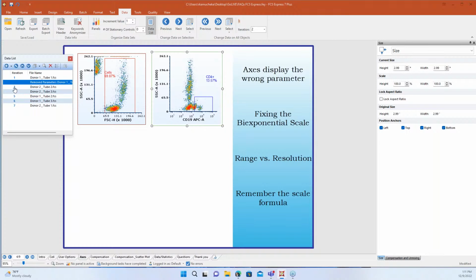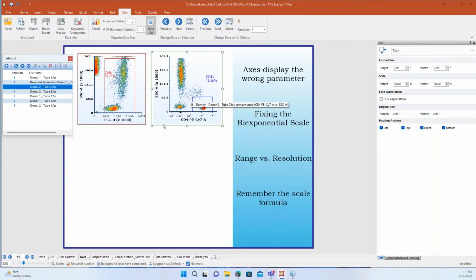All right, and now the next one I've seen a lot is talking about our scales. When we look at our data files, we want to make sure that we're looking at all of our data files through the same scaling. What can happen is that when you bring your data into FCS Express, it does an automatic feature. So it adjusts it so that you can see it as best as you can here.